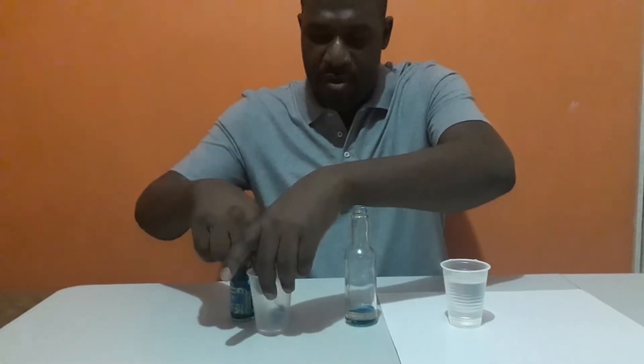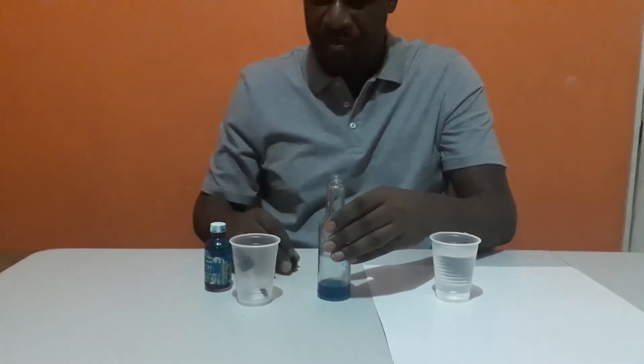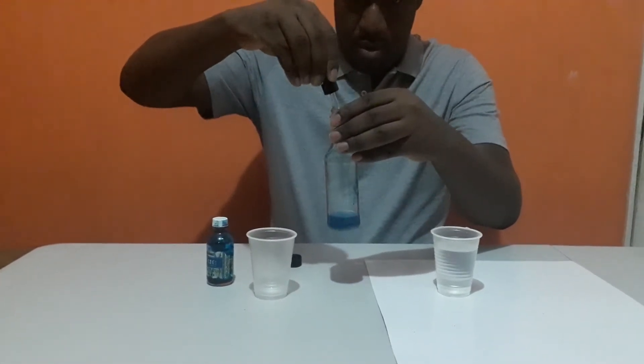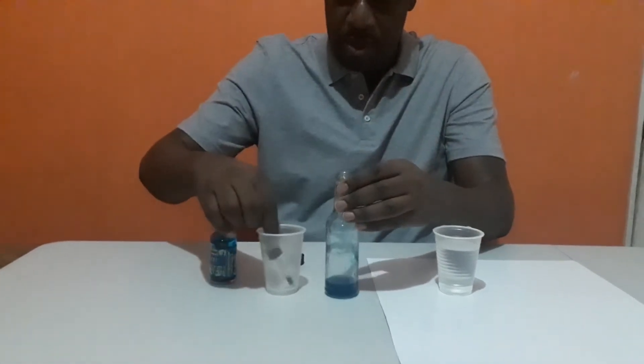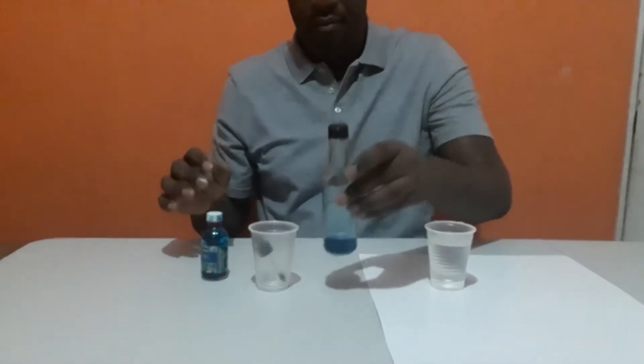Alright. So now I have the blue dye and it's going into the oil. I'm going to shake it a bit to get it dissolved, then add another drop, two drops, and shake — like that.